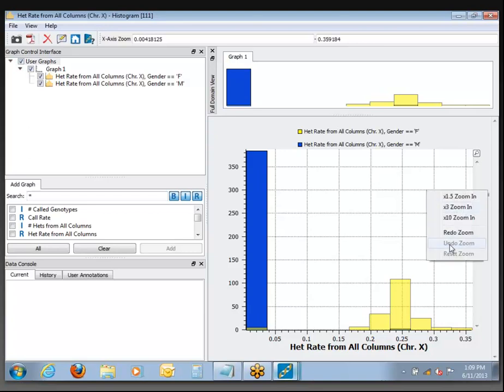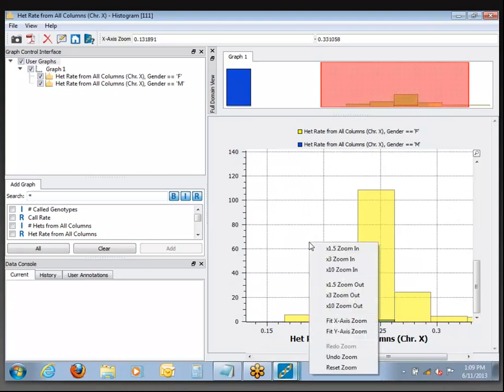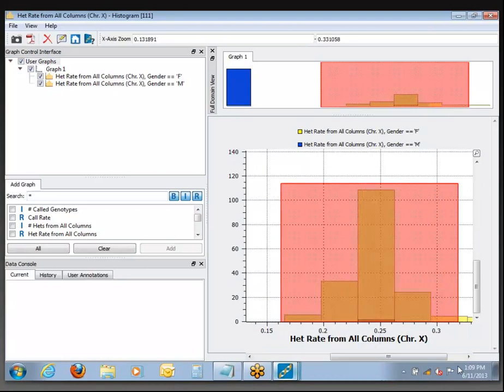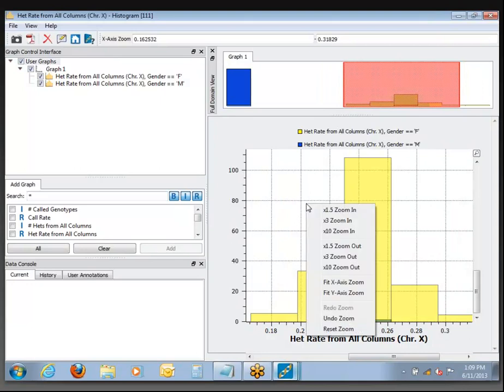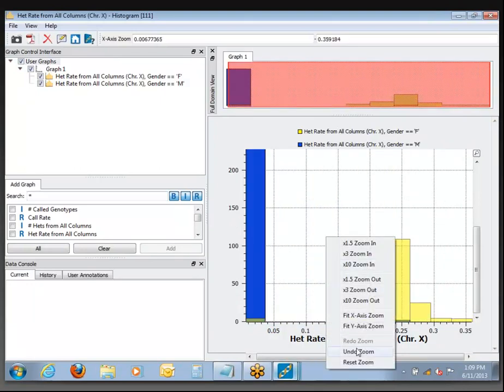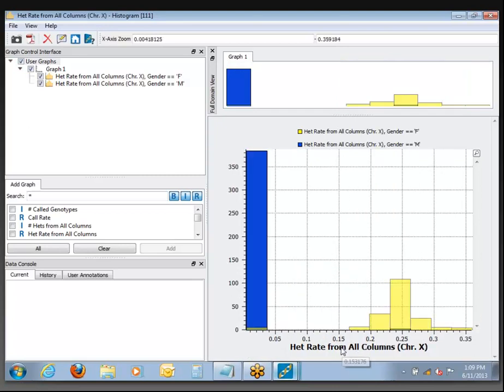There are different multipliers as well — you can click and drag inside the window to have a box to zoom on. You can zoom out three times, or undo zoom, or reset zoom. That's all just by right-clicking right inside of the plot.